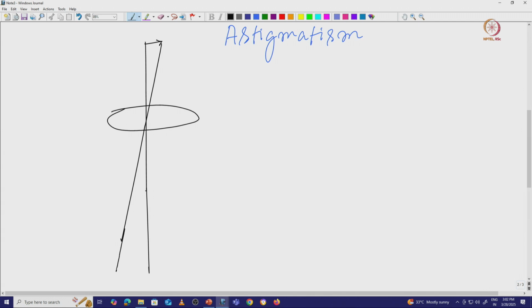So it is going through the center. Now you can see any particular image. Previously when drawing, we tried to keep these things in the center, but here there is some kind of deviation, and that is what we are going to point out. If there is some kind of change at the beginning, that change is going to be reflected here, and this is the ray that is merging. Definitely it will go and converge at one particular point, where these rays converge here.